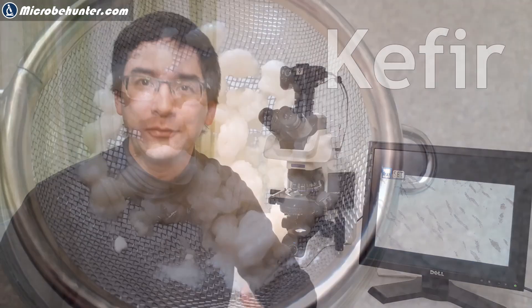Hi, MicrobeHunter here and today I'm going to be doing a little bit of biotechnology. I'm going to be fermenting some milk because I would like to put kefir under the microscope.